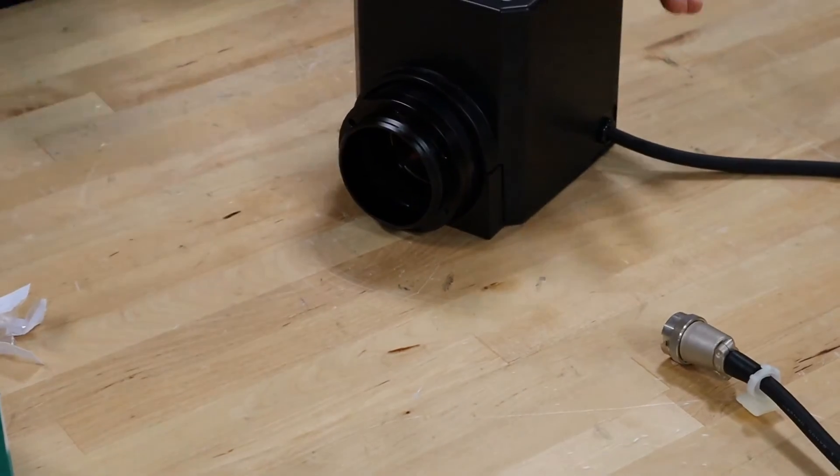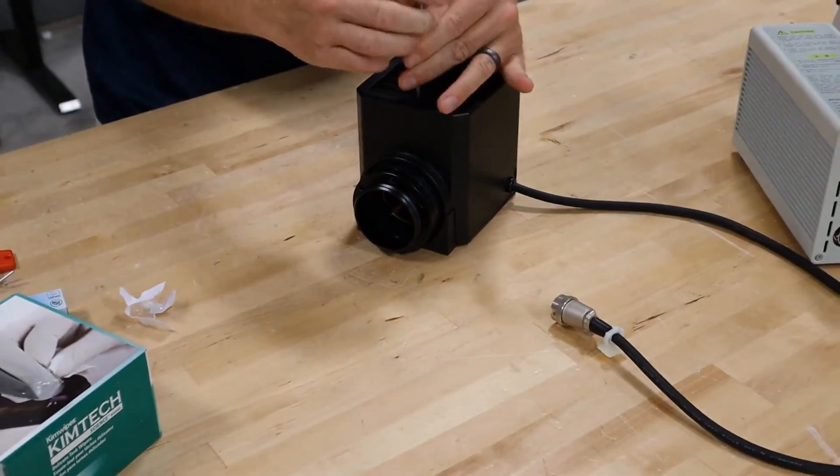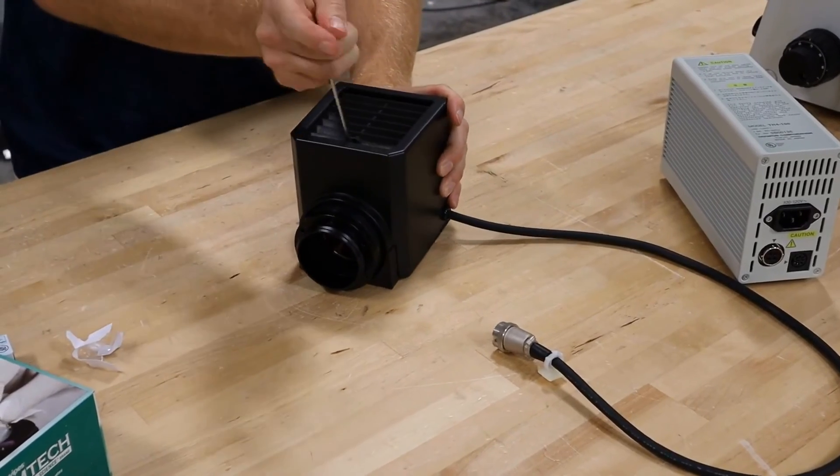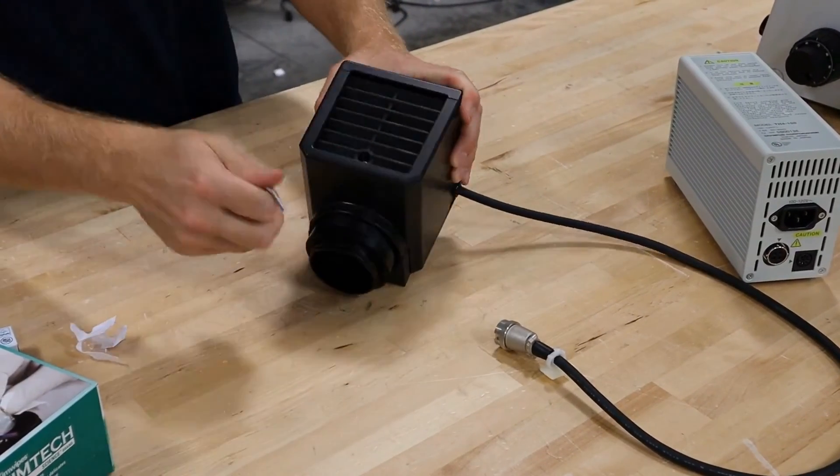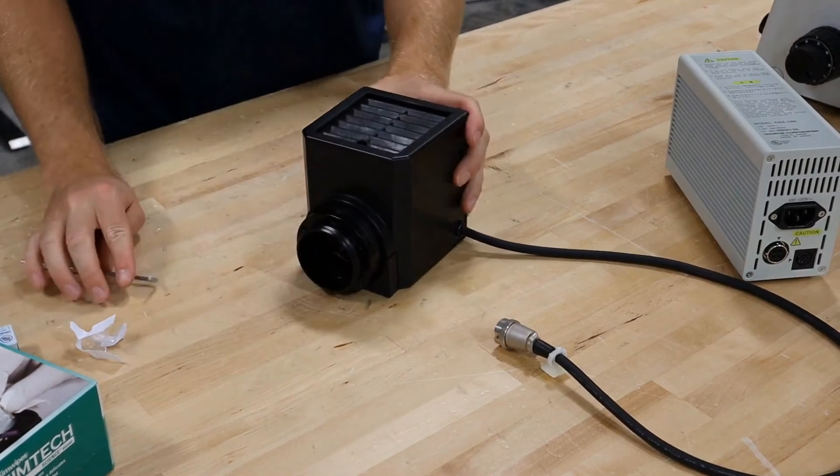And that's how to change the bulb on your Olympus BX50 N51 microscope. If you have any questions, please let us know and feel free to contact us if you have any other inquiries. Thank you very much. Have a good day.